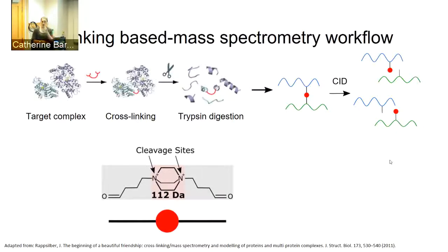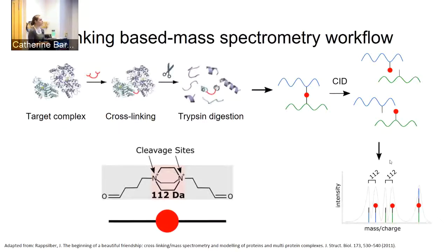And that's really important because that's been one of the issues with cross-linking-based mass spectrometry for a while. The technique has been around for years, but people weren't able to use it very effectively because these cross-linkers either could not permeate the cell membranes to get in and cross-link the proteins in the first place, or they wouldn't fragment very well. And so the downstream analysis wasn't clean at all. You could miss the cross-links, or they could look like some other kind of modification, and it got really messy. This fragments super cleanly, and so what we're able to do in the mass spectra is just look for that shift of the Dabco moiety.